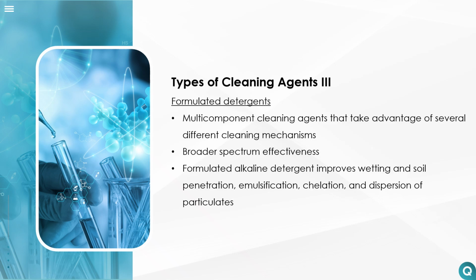Formulated detergents are multi-component cleaning agents that take advantage of several different cleaning mechanisms. Their versatile approach allows for broad spectrum effectiveness. For example, formulated alkali detergents might improve wetting and soil penetration, emulsification, chelation, and dispersion of particulates in the wash step.